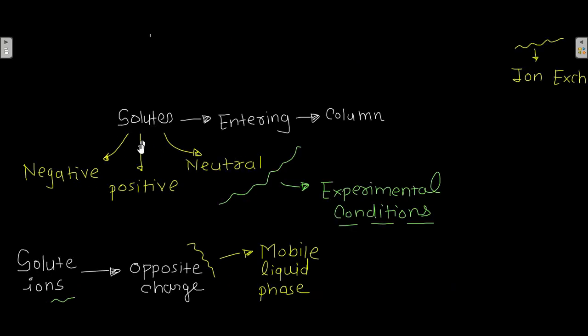Now the solutes which enter this column can be negatively charged, positively charged, or neutral. Whether the solute will be positively charged, negatively charged or neutral depends upon the experimental conditions.